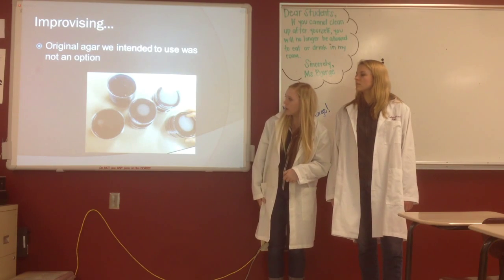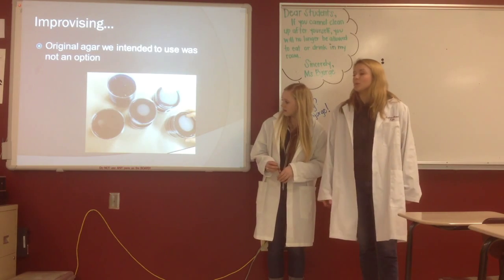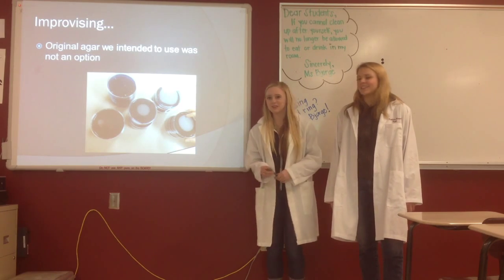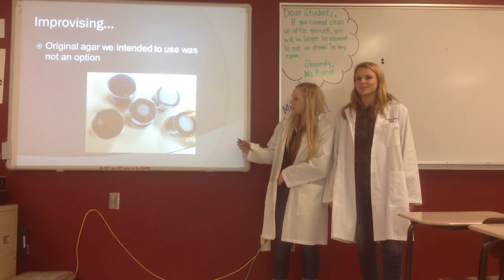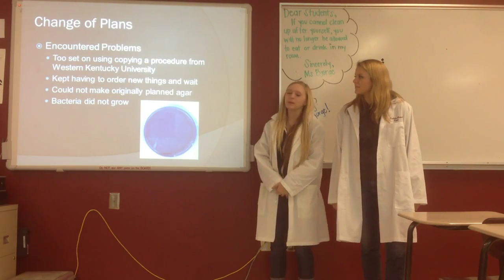And these are our plates. After we poured them, as you can see they're blue colored, and that was due to the malachite green that we added — it was in the recipe, that's why they're blue. And so our plates ended up not working.